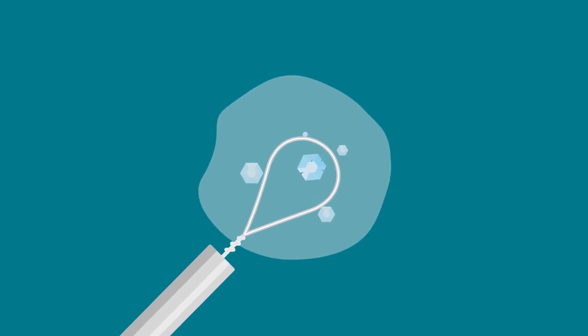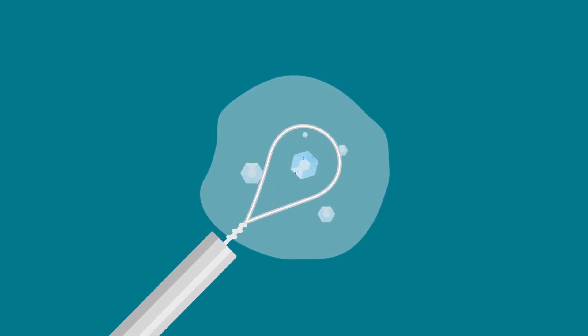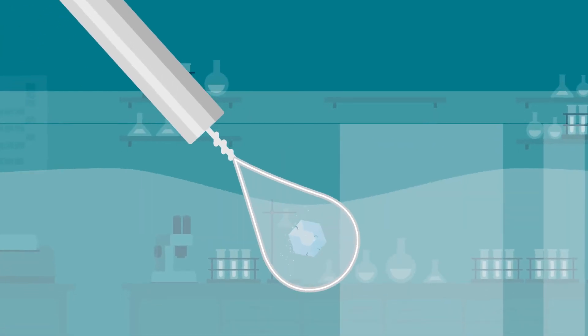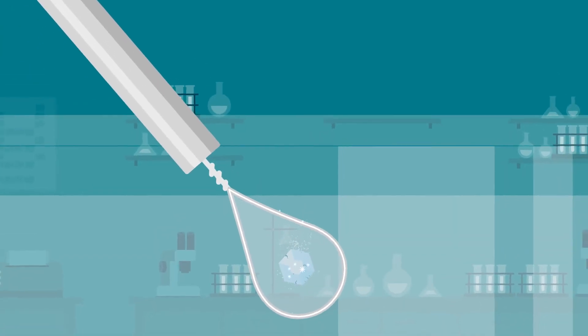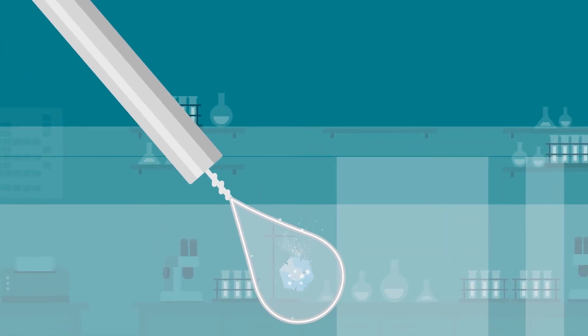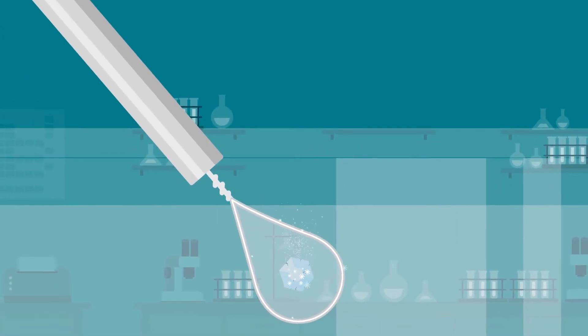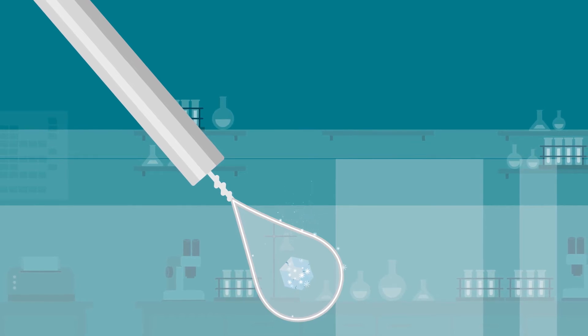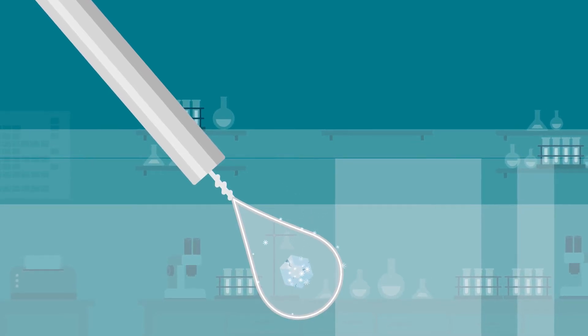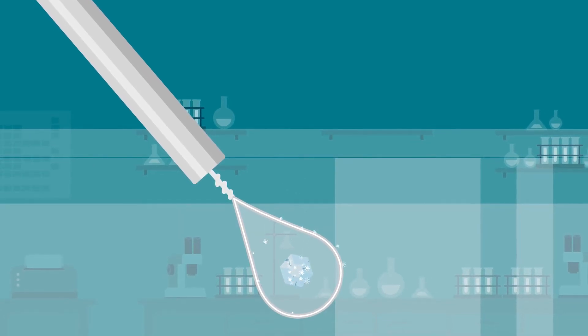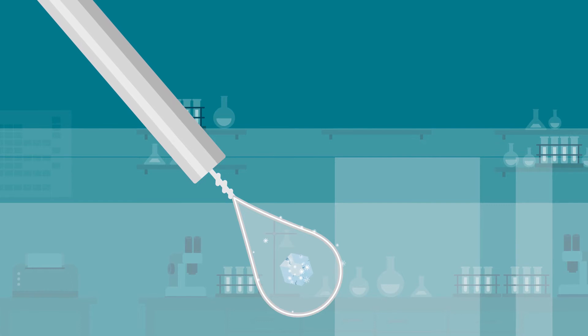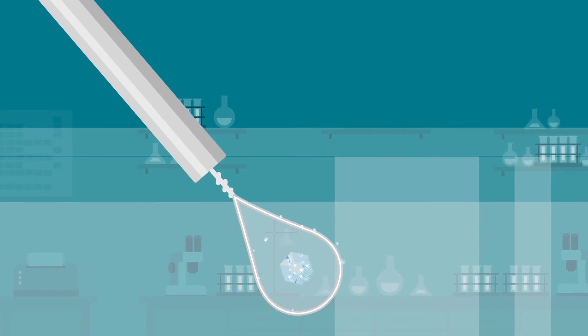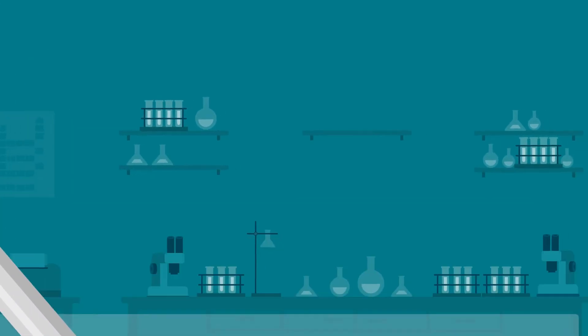Second, extra fluid left surrounding the crystal often degrades the cryocooling process, slowing the crystal's cooling rate and allowing more time for the growth of crystalline ice on and within the delicate crystal. Ice formation damages crystals and lowers the quality of their diffraction.